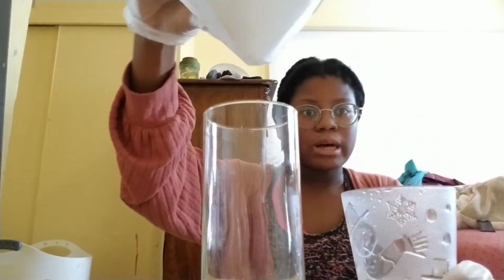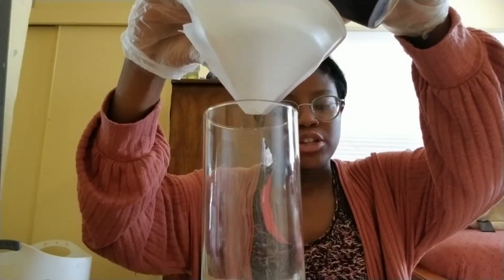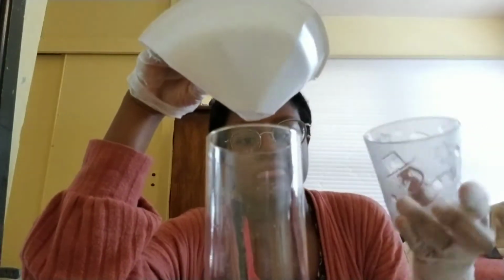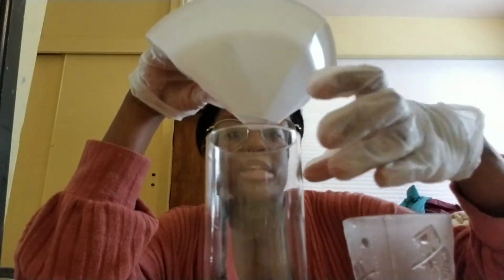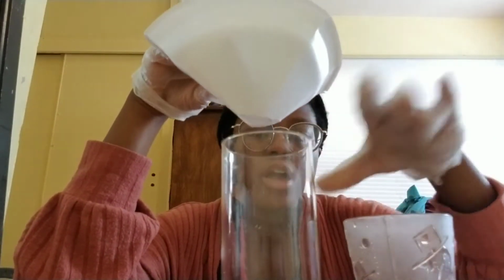And then this is a funnel up above, and what we're going to do is simply pour this, and the bottom should be clear. Pouring it in, we have the potassium aluminum hydroxide on the bottom. We rinsed it 2 to 3 times with 2 to 3 milliliters of deionized water to make sure there is no leftover, and we will throw out the filter paper. We're going to allow our filtrate to cool to room temperature.